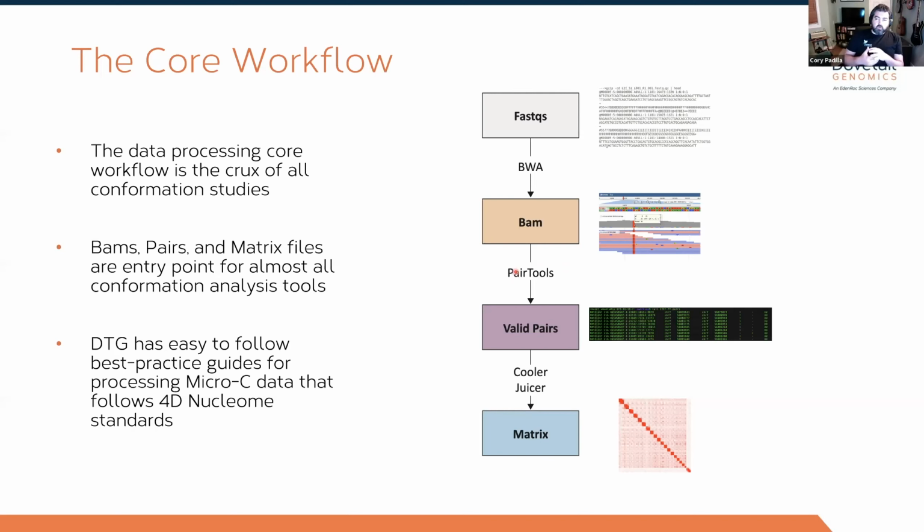Now, if you're unfamiliar with pairs or pairtools, all it is, is a very simple table that distills your alignment information down to the read name, the chromosome of read 1 that it maps to, the midpoint, not the range, just the midpoint of read 1, the chromosome that read 2 maps to, the midpoint, the strandedness, and then it gives it a Hi-C qualifier based on whether or not it's a PCR dupe, and then the insert size and the strandedness of that Hi-C molecule.